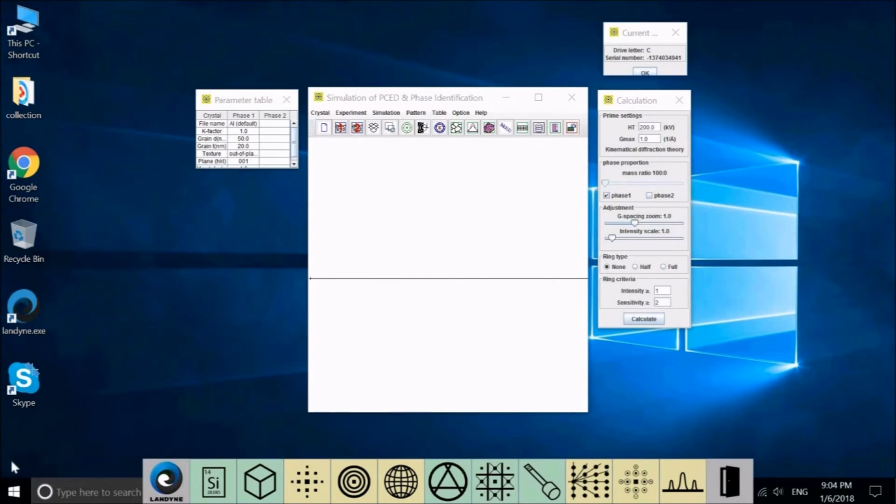Although the structure file looks simple, you may have a problem if you write or edit a file in which it doesn't meet the required format exactly. Therefore, we suggest you use the template to create a new file. In order to avoid any mistakes, you should view the structure with the SV82 after you created the new structure file.